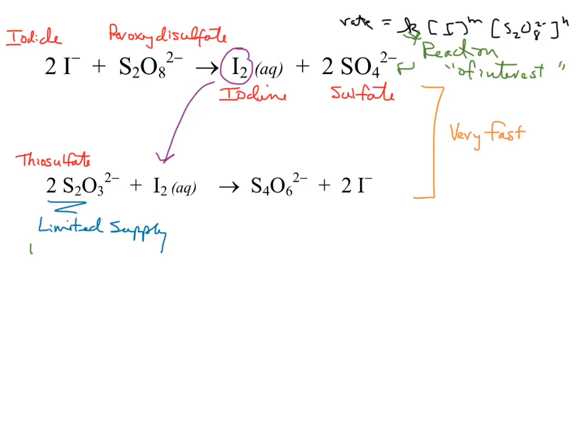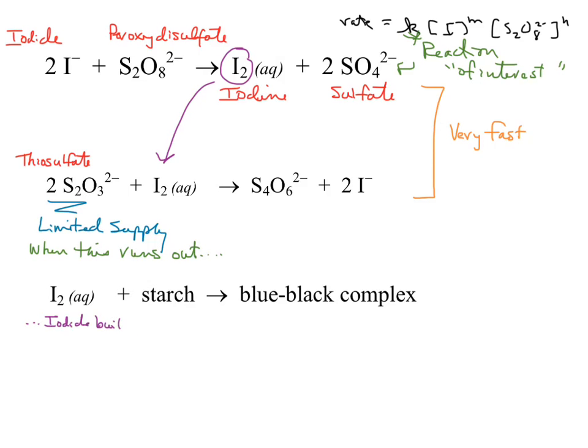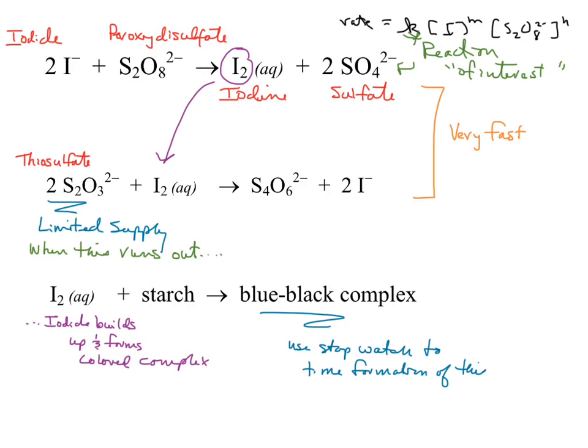So here's the deal. The chemistry looks like this. When the thiosulfate, which is the same in all 8 trials, runs out, what's going to happen is basically your solution is going to turn from maybe cloudy to blue. So you're looking for a blue color. So bottom line, in these 8 trials, you are going to look for the same consumption of the thiosulfate, right? So the nuts and bolts of what you're doing look like this.